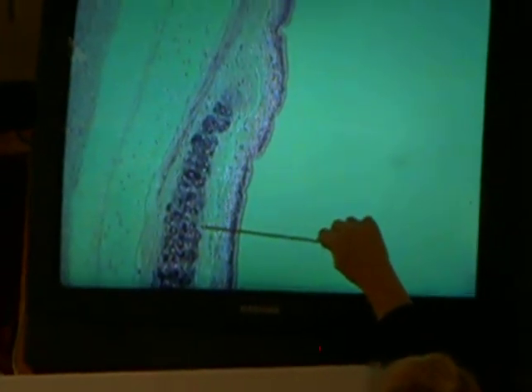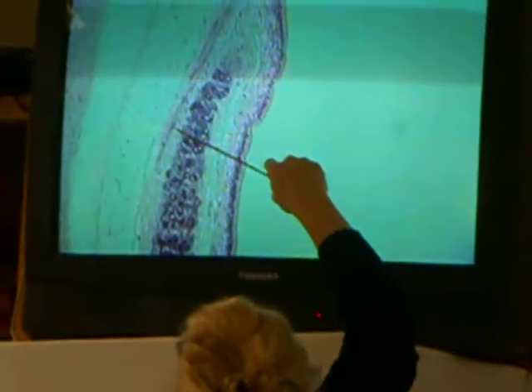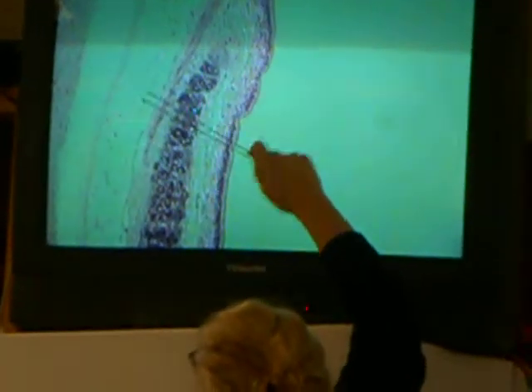So did everyone see? This is one side of the C ring. So it goes around the back of the trachea, and then what we see is a bunch of smooth muscle that starts at the end of the tracheal cartilage and goes all the way across the other side. So go ahead and, Jeannie, just point up there to where the cartilage is, and then go back, to the left, I should say. Right in there. And then up. All of that is smooth muscle. That's the trachealis muscle. If your tracheal cartilage is a C, the trachealis muscle is what bridges that gap.